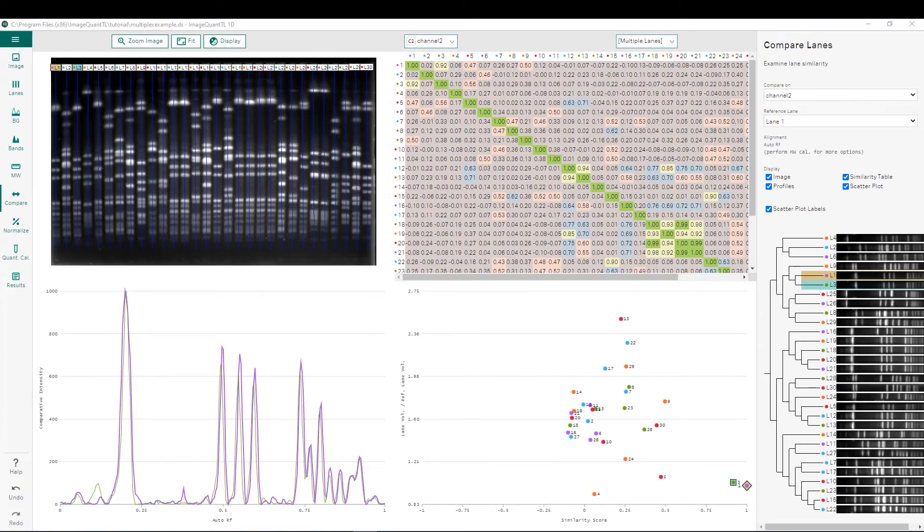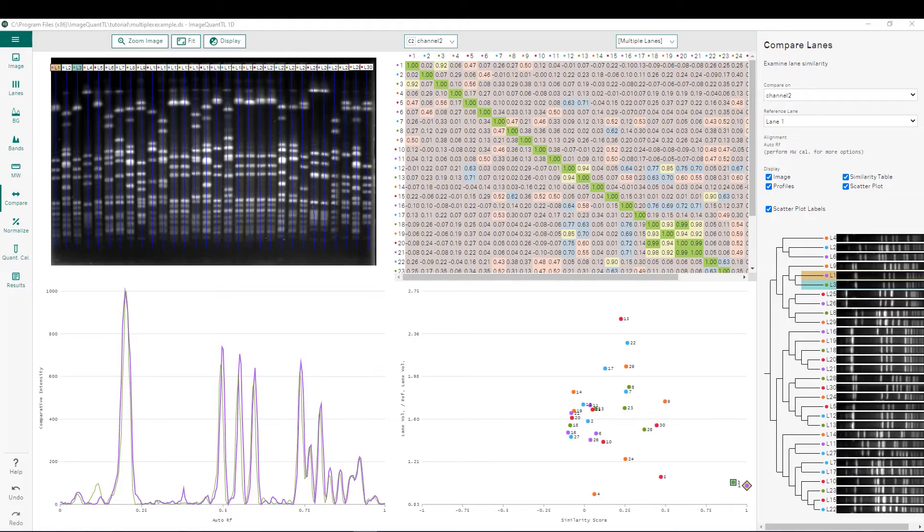Here we are showing the lane comparison functionality that was added to ImageQuantTL version 10. You can use this functionality to compare different samples between different lanes whether that is samples from different patients, different fractions during a protein purification, etc.